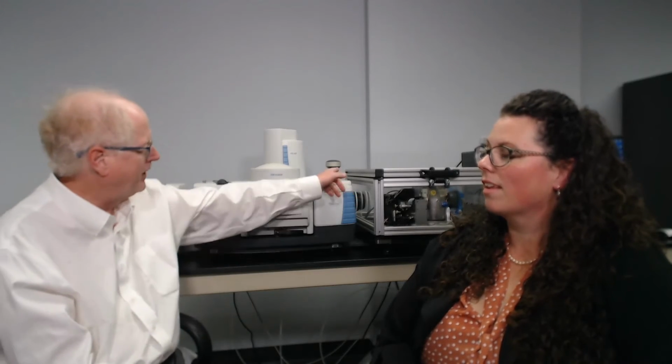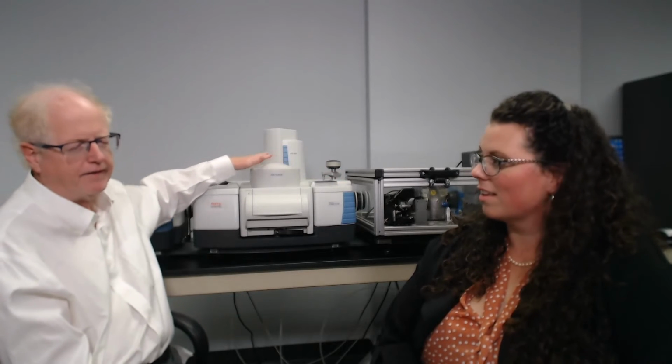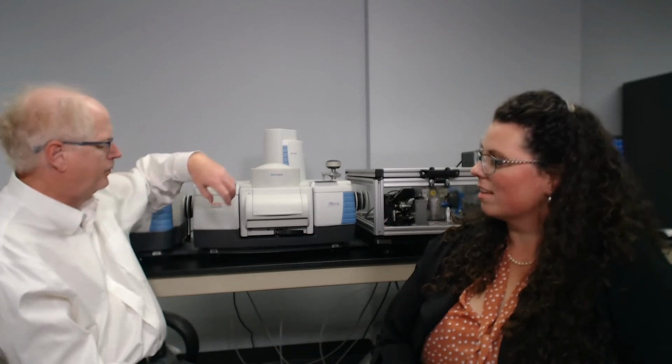But you can also put a source at the point where the sample is located and run the beam backwards through that microscope and bring that beam into the Nicolet IS50 and do your detection here with whatever detectors you've got installed so that you can look at emission sources such as OLEDs, organic LEDs, or things like that where you're really looking at the spectral range of what they're putting out.